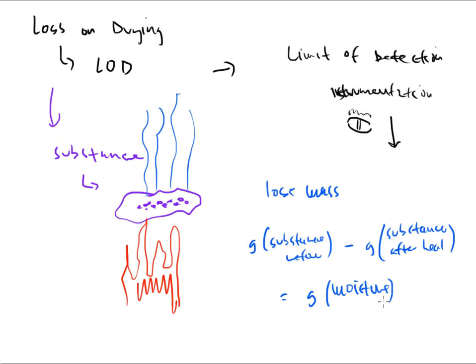So when I say moisture, your mind is going to water, and that is the majority of the mass that we are talking about. But again, keep in mind, there are other substances that will be driven off other than water because their boiling points are lower than 100 degrees. And that's the temperature that water will be driven off.